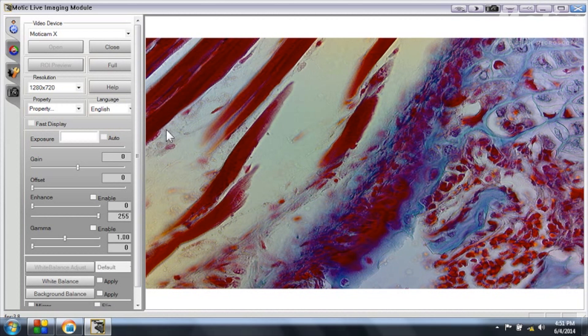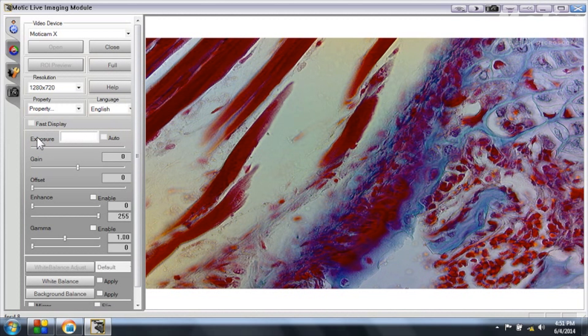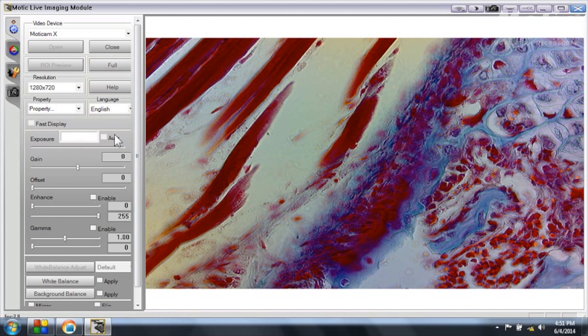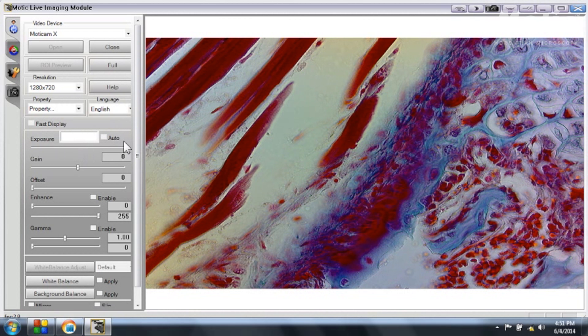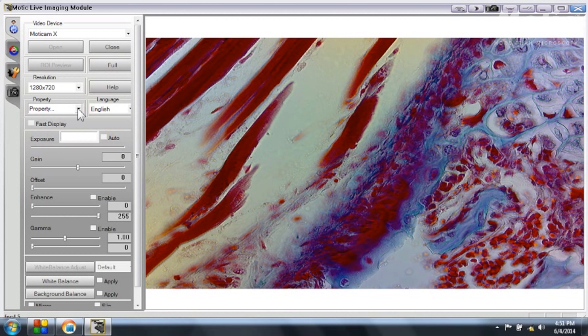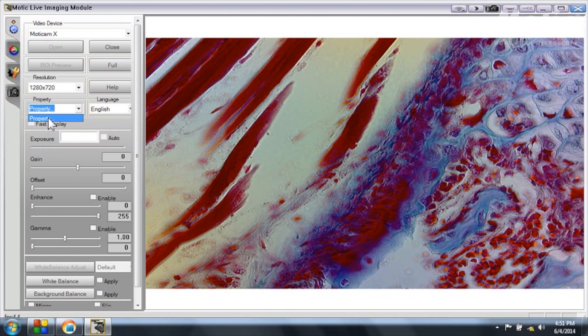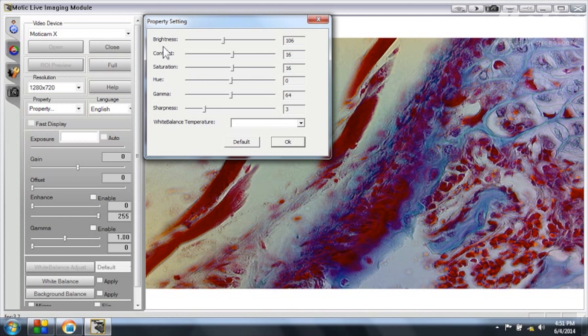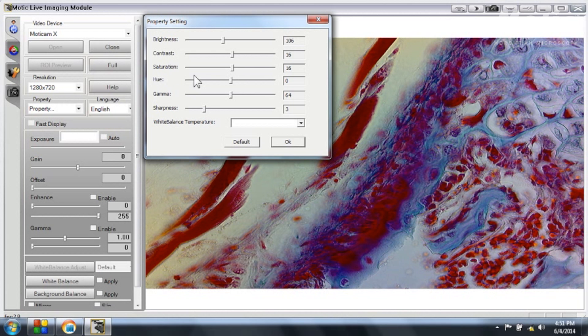You should be aware that the exposure time is regulated automatically inside the camera. So this function is not activated in the software. And if you would need to do some specific settings you can open the property window. You can see here that you can adjust brightness or contrast or any other options.